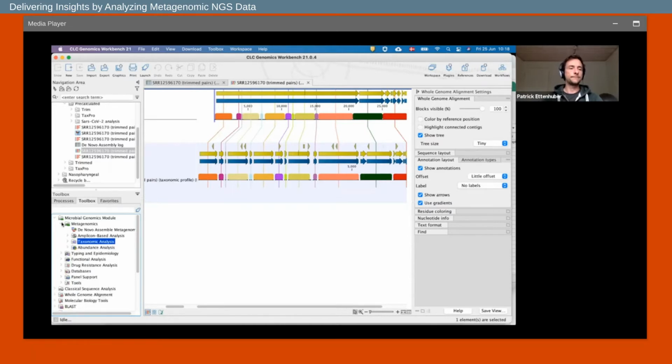And then you would possibly, as a next step, associate it with CDS, either by aligning it to their respective references using the whole genome alignment tools, or using the annotate with BLAST or DIAMOND tools and a respective BLAST or DIAMOND reference database, which again is obtainable in the databases subfolder.